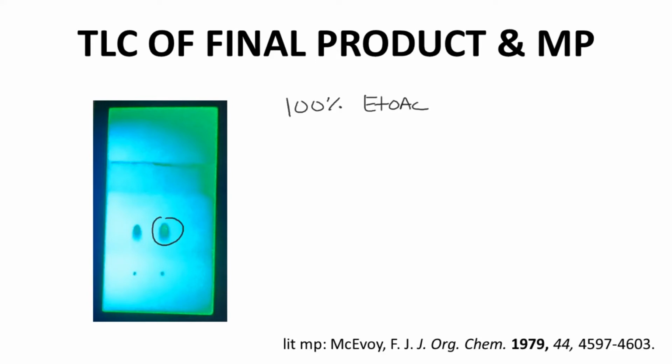Remember that this product is technically a crude product. We have isolated the product through a precipitation, but it hasn't formally been purified through chromatography, distillation, or recrystallization. So for a crude product, this single spot is very encouraging. The Rf value is approximately 0.40. Now, seeing just one spot does not mean the material is clean, but at least it's a good start.